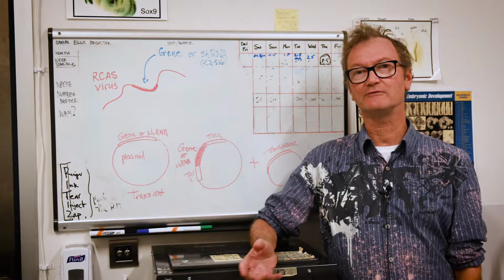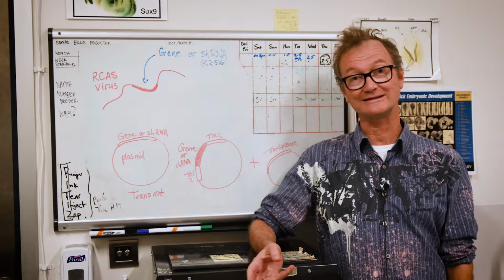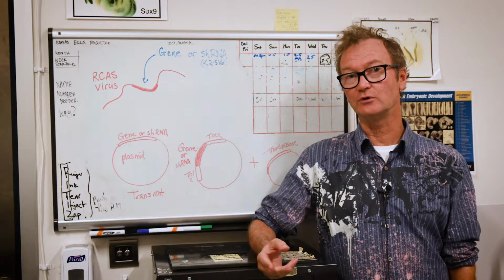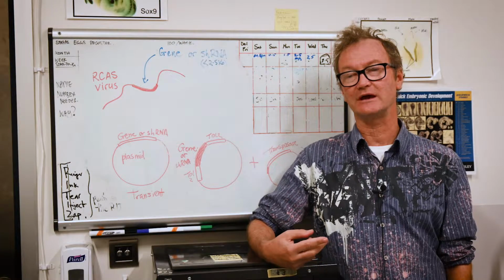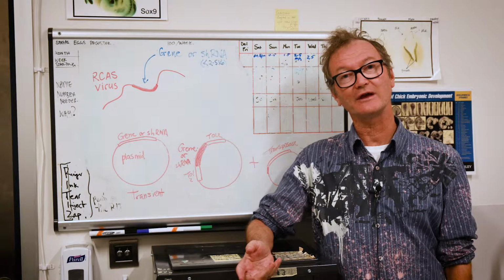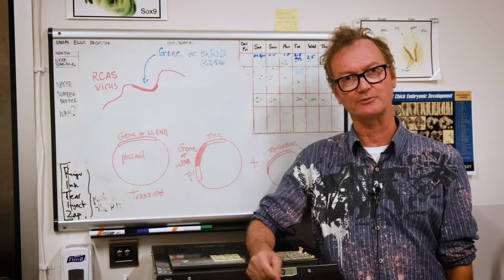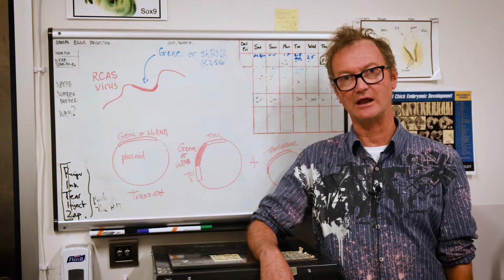Electroporation involves the transfer of DNA into the embryo across an electric field, and this has some advantages and some limitations. The advantage of electroporation for gene expression analysis is that it allows a rapid experiment to be conducted, and it's rather inexpensive. One of the limitations is that only certain cell types can tend to be targeted by electroporation. So I'm going to go over the procedure of electroporation now.